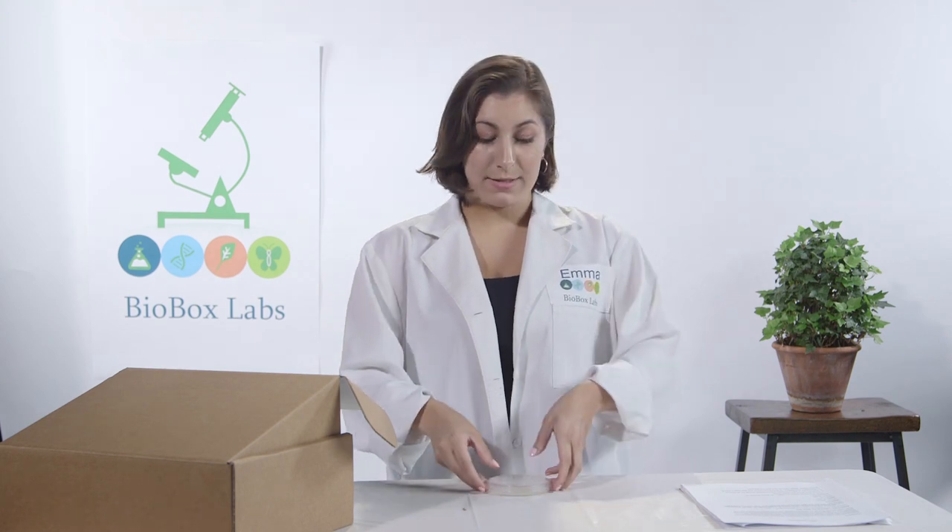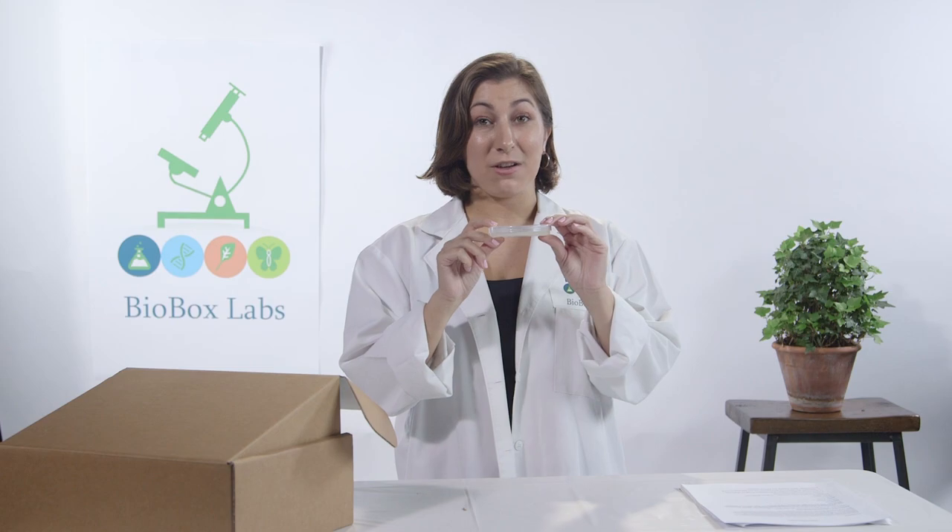Hi guys, I'm Emma and welcome back to BioVox Labs. Today we're going to be making microbe zoos, which is basically a place where bacteria and fungi can live and grow.